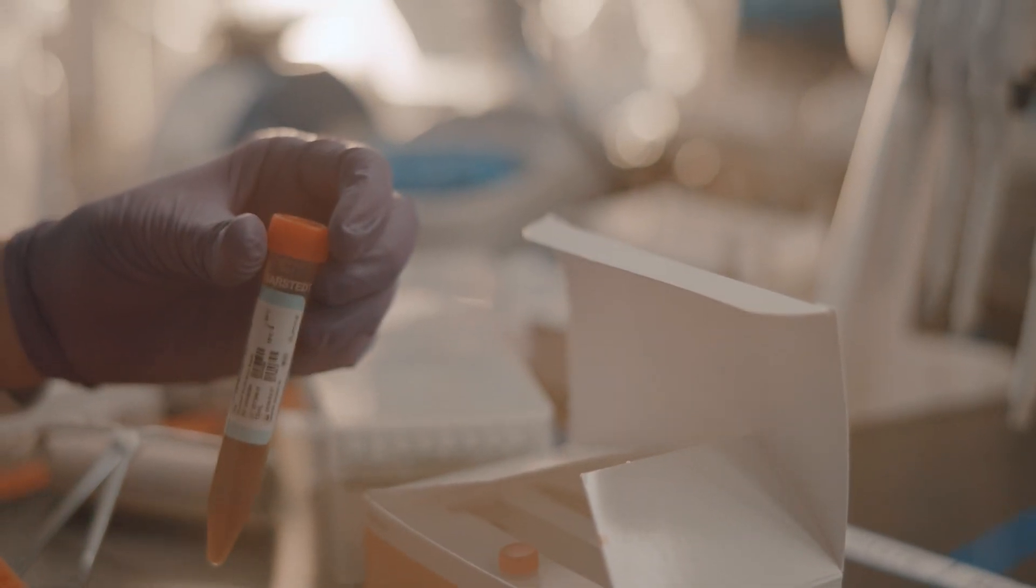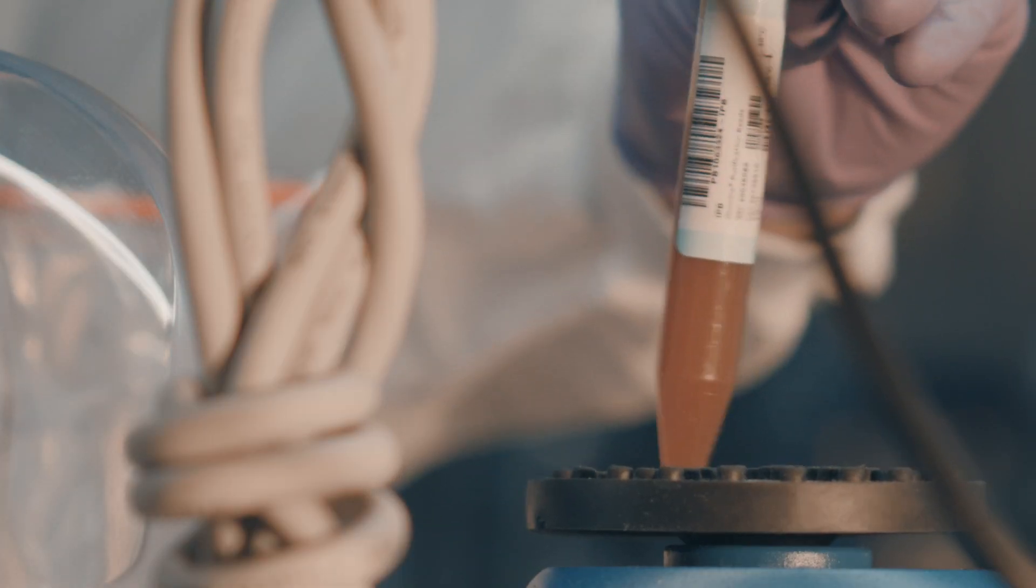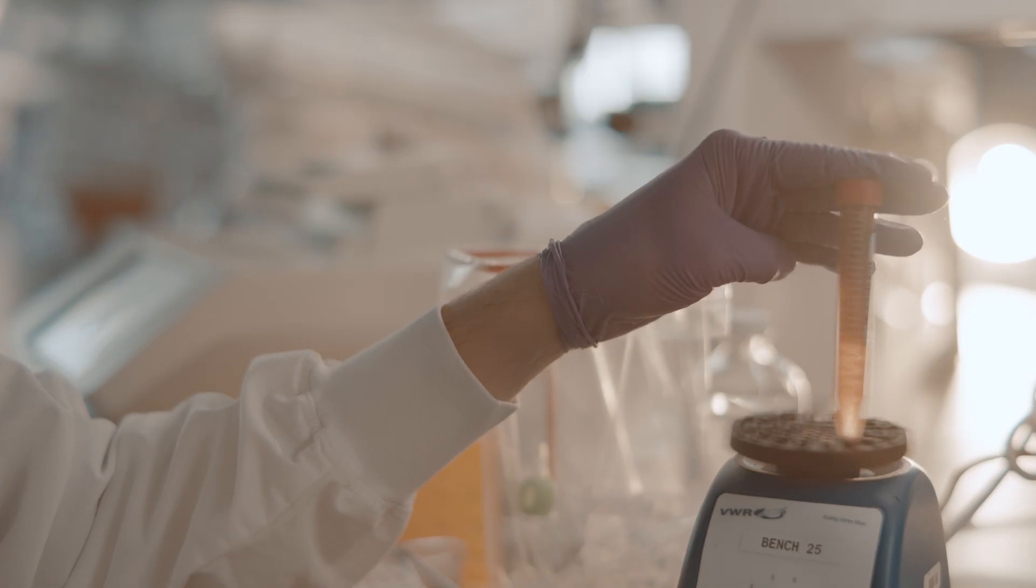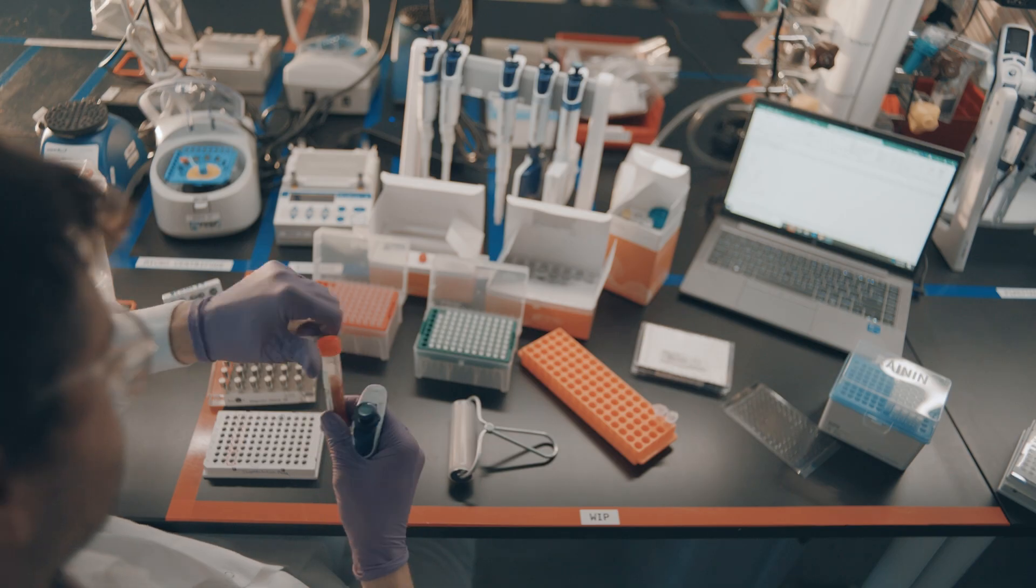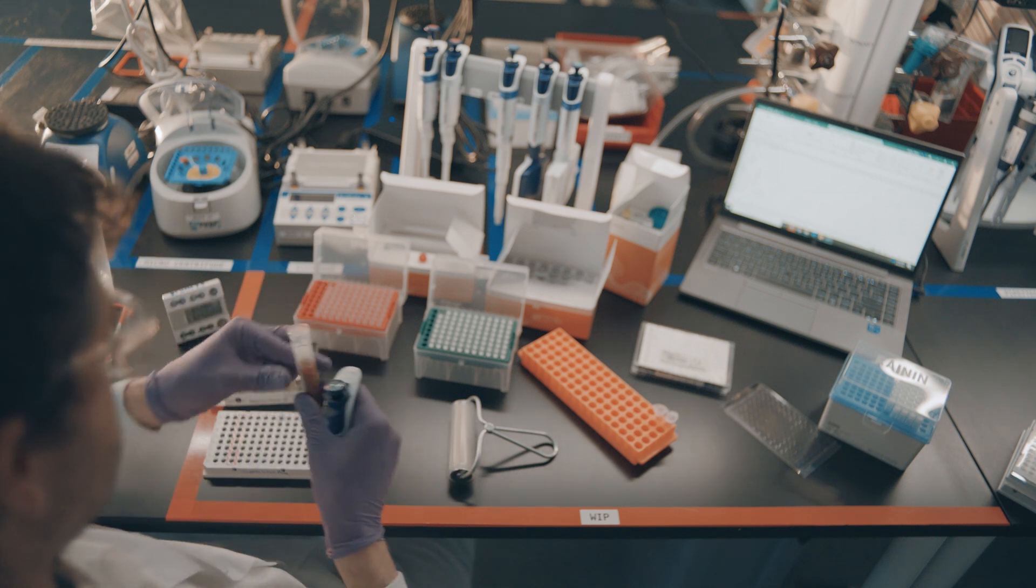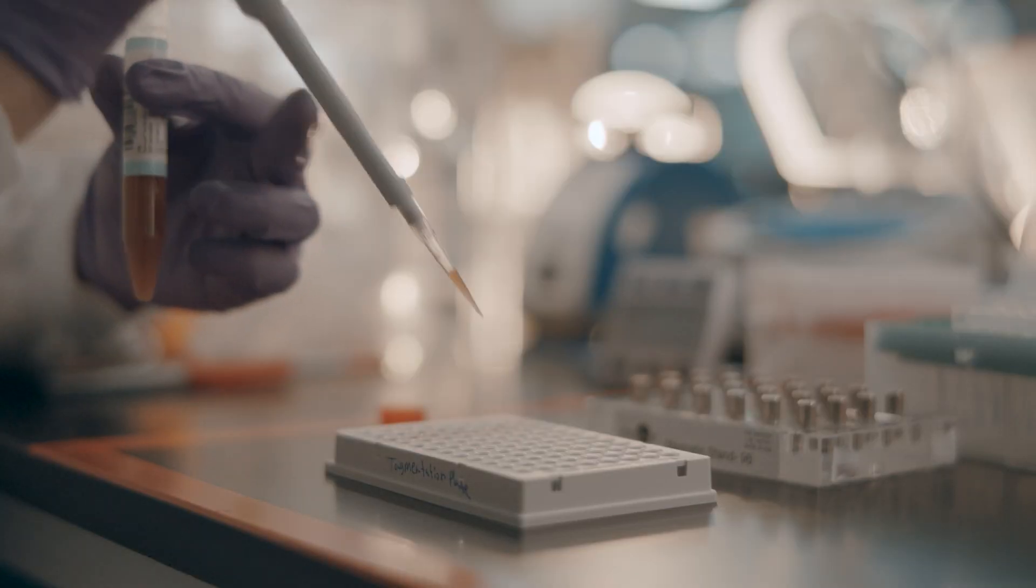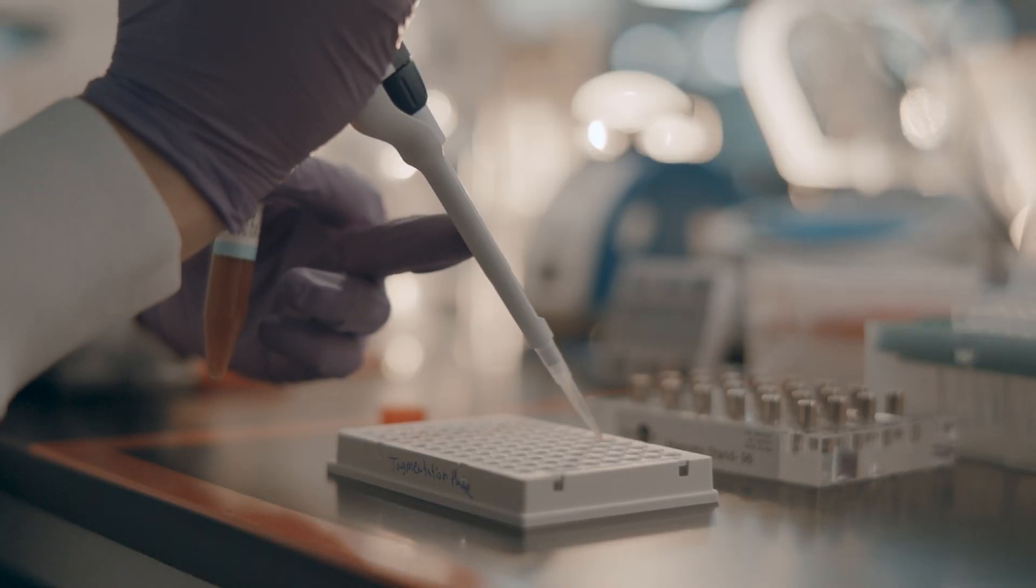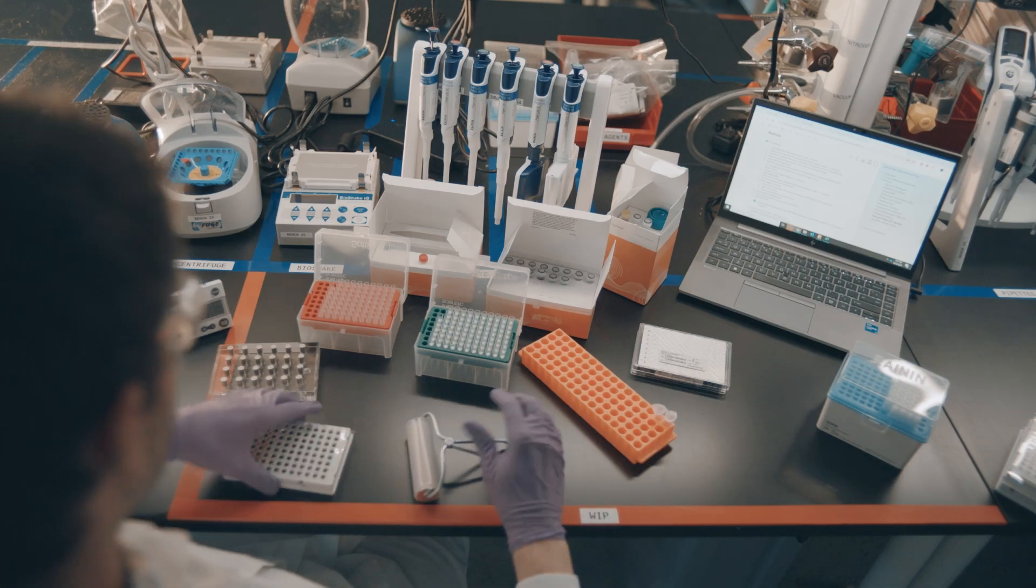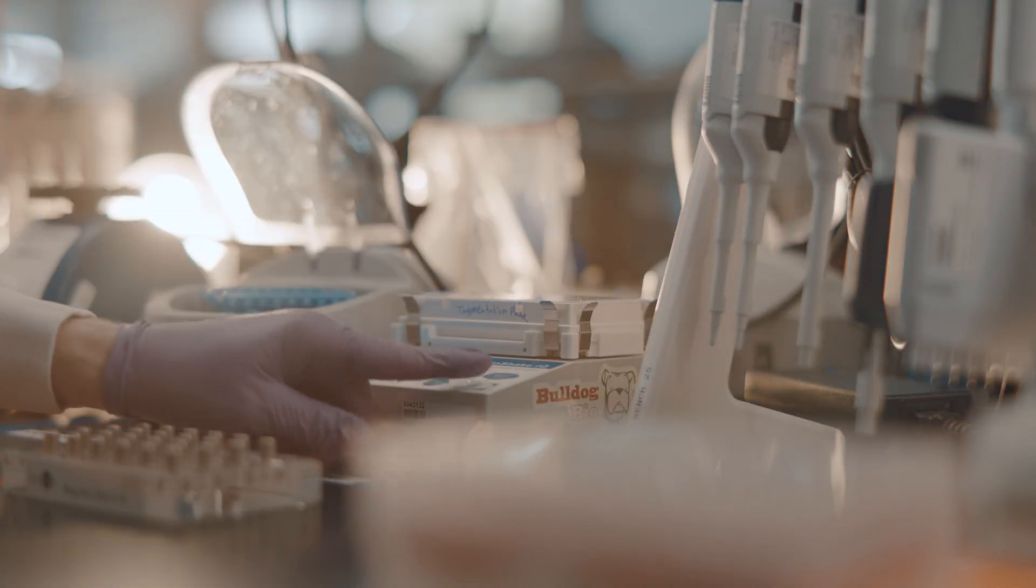After indexed PCR, the final step is to clean up the sequenceable libraries. Users have an option to clean up as a pool to save time and effort or to clean up each library individually. Cleaning up libraries individually can be advantageous if followed up by QC steps, such as the bioanalyzer or tape station or qubit assays.